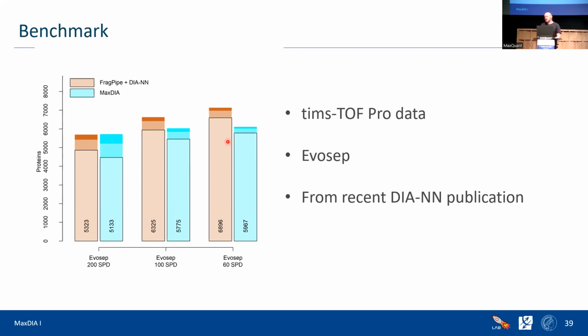Okay. And also, for phosphoproteomics, I would now always do it with a library, not in silico. That's also something we're working on, but it is a bit impractical to produce the whole phospho library as one thing. It is much better to do this on the fly as well. But that's something we're working on.